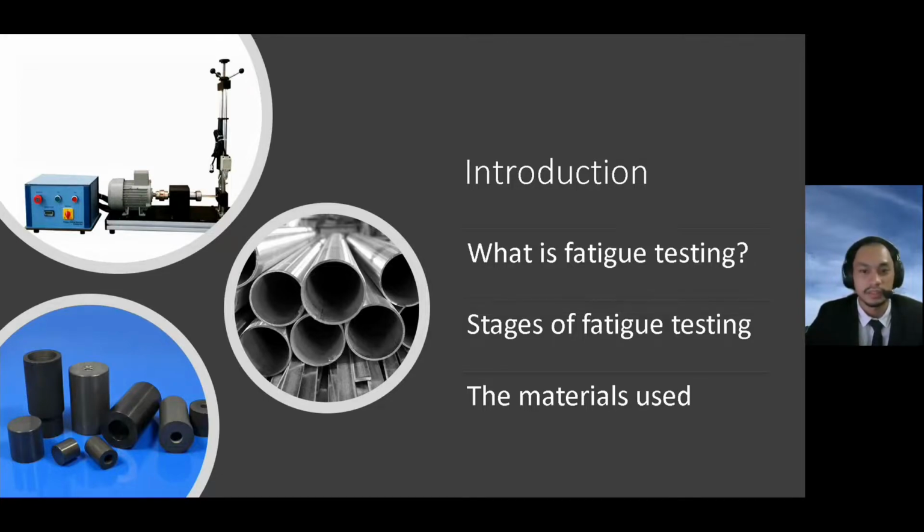For this test, the materials chosen are silicon nitride for ceramic and aluminum alloy for metal. Silicon nitride is a chemical formed by combining the element silicon and nitrogen. Silicon nitride produces high-quality components for use in extremely demanding applications because it can withstand the rigors of severe thermomechanical and corrosive situations. Silicon nitride has superior properties such as high hardness, light weight, high temperature stability, and wear resistance. Cutting tools, engine components, bearings, and metalworking are all examples of silicon nitride applications.